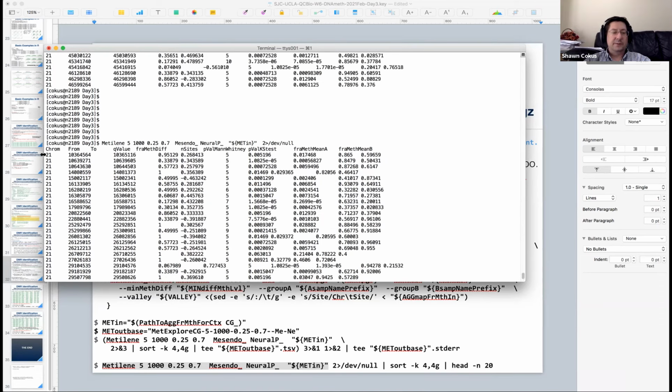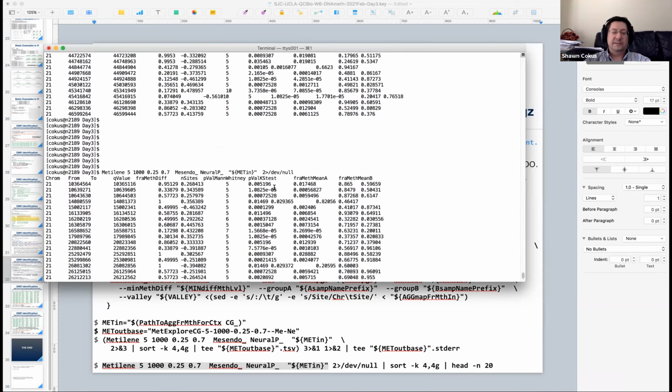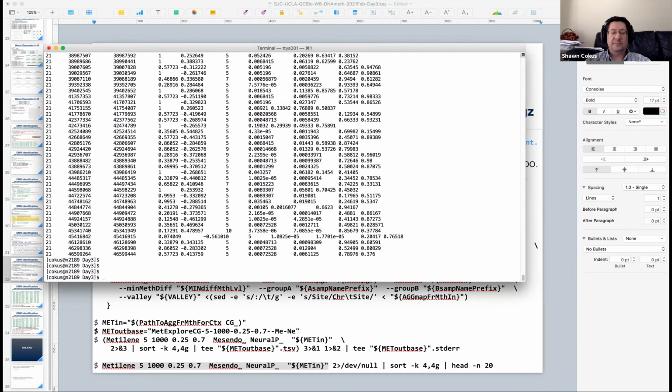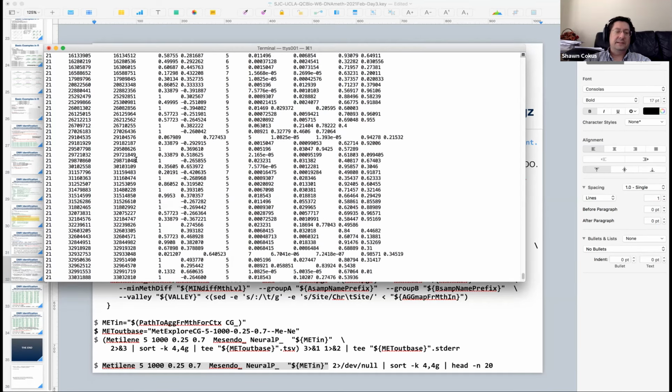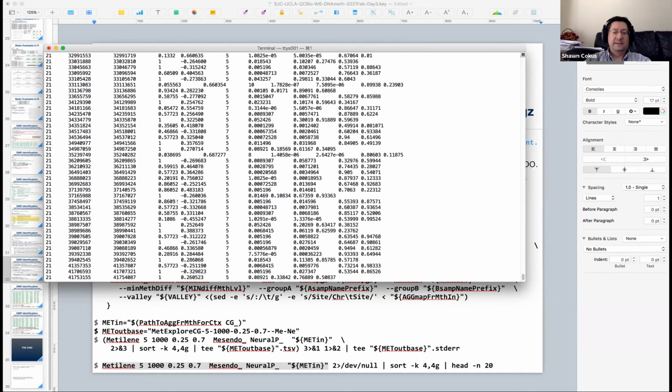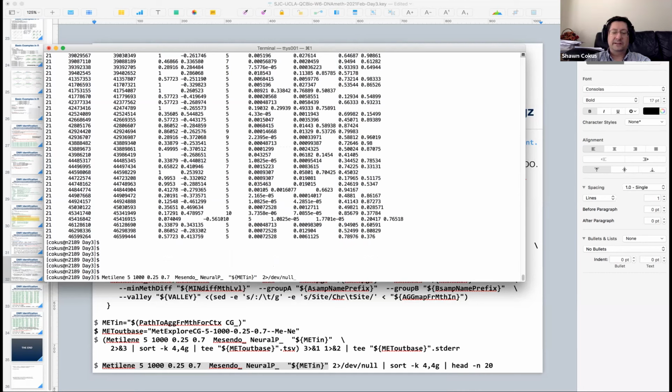Now we just get the output, which consists of the header line we added on there as our memory jogger and the actual data. But like I say, for experimentation by hand right now, we don't really need the full list. We just need the top of the list. It's not sorted by Q value, which is column number 4. So before we start taking the top of it and cutting it down, we better sort by column 4. So sort -k4,4 sorts on column 4, but we have to tell sort what mechanism to use.